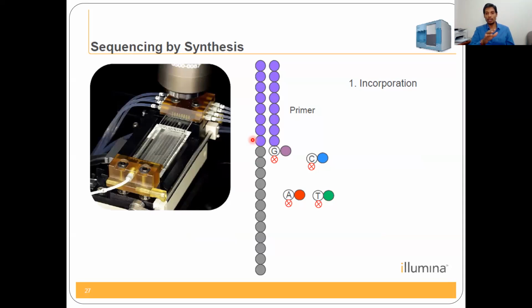The steps are injecting the nucleotide, visualizing the light, and washing, then injecting the second nucleotide, visualizing the light, and washing. So each time only one nucleotide is injected in the case of pyrosequencing.